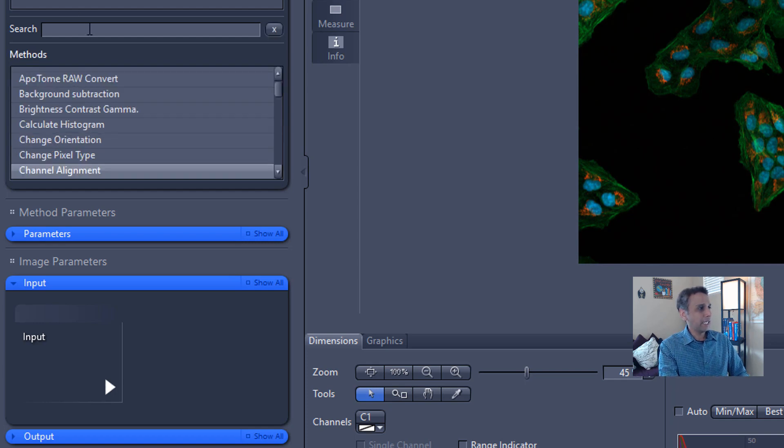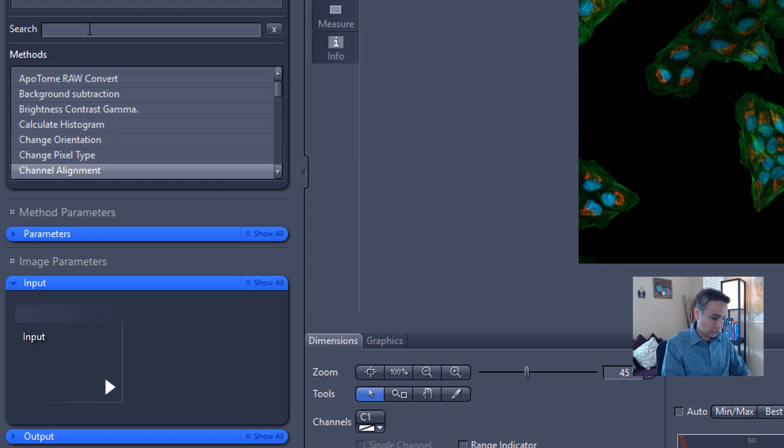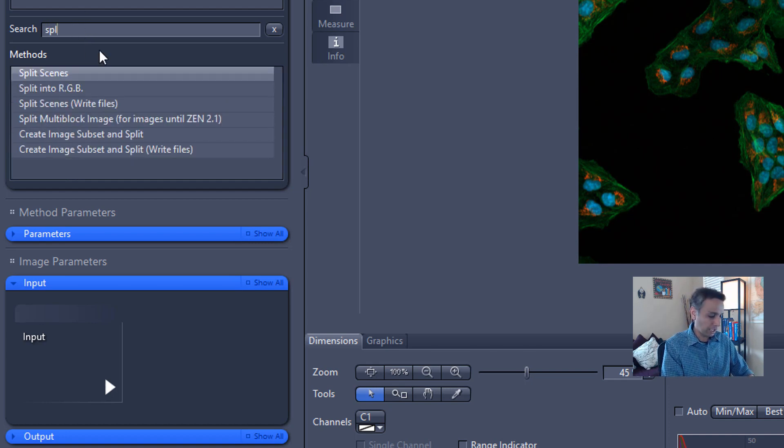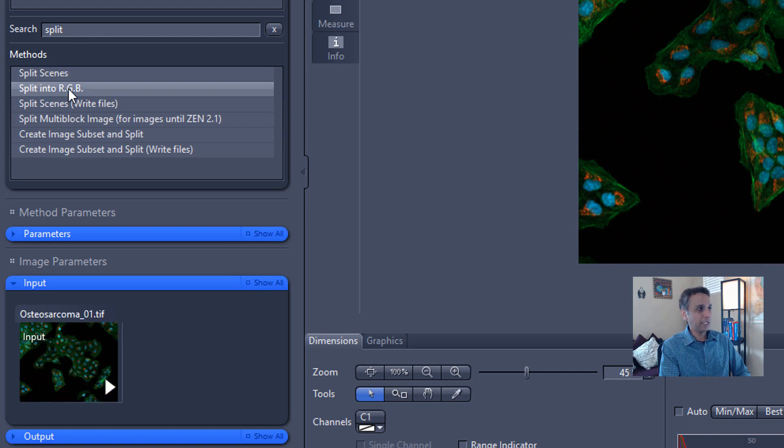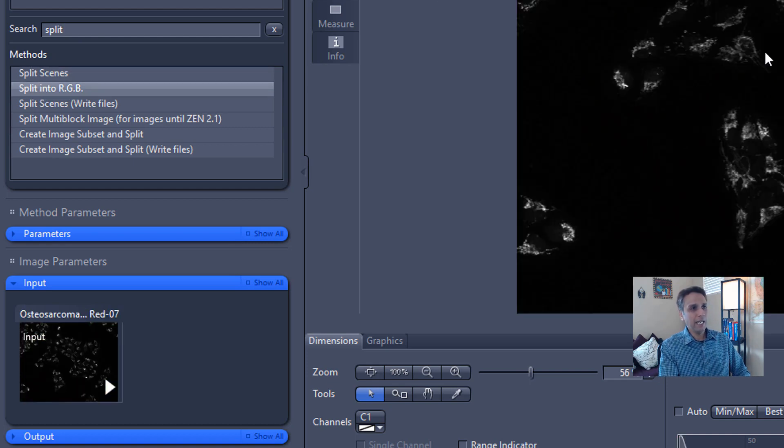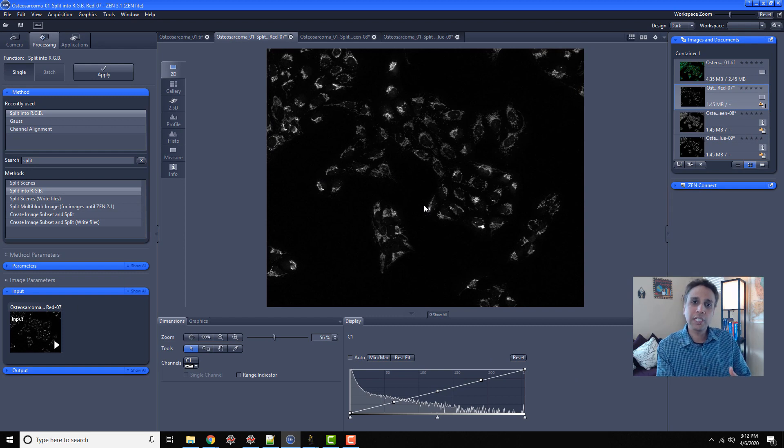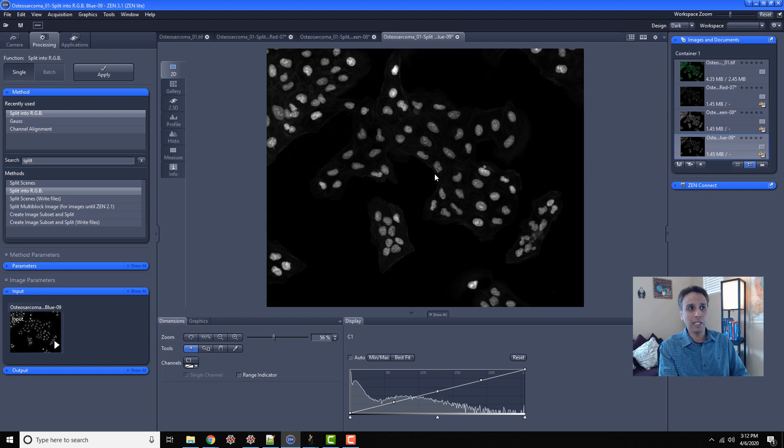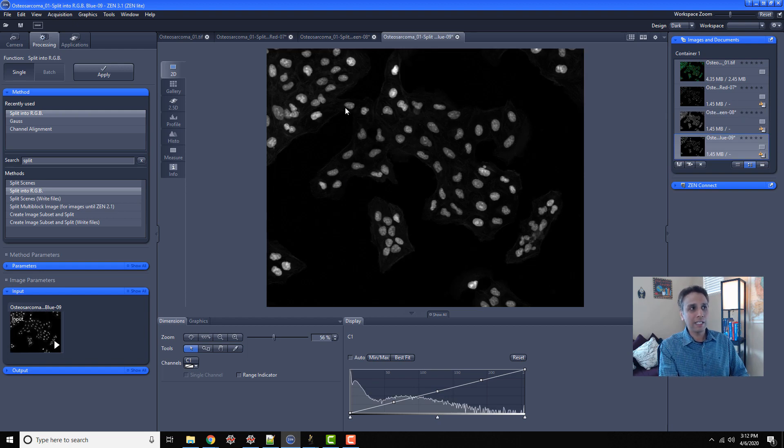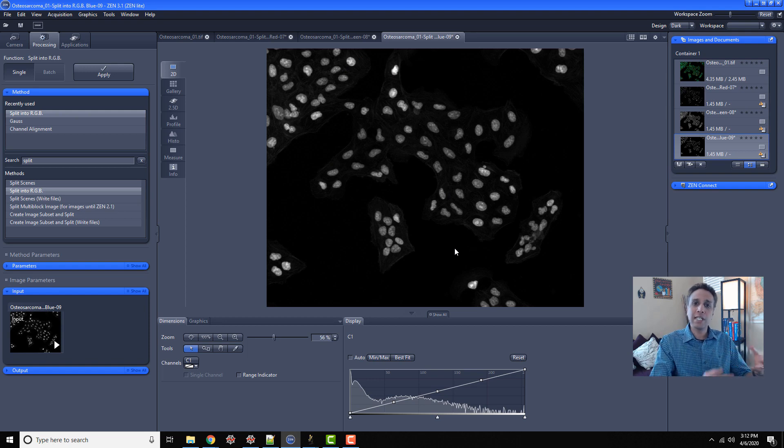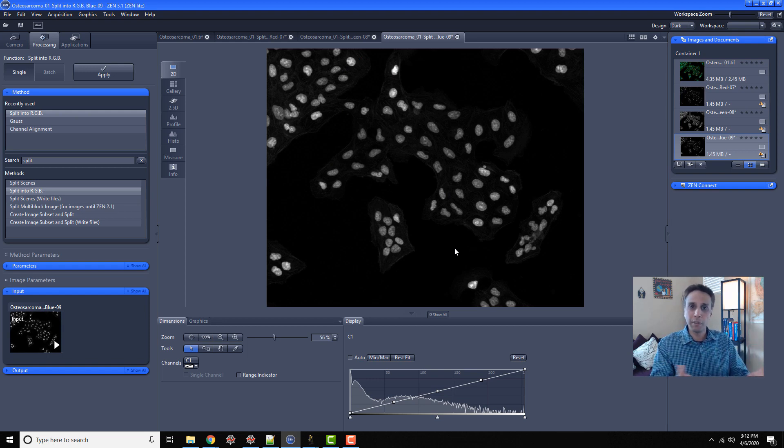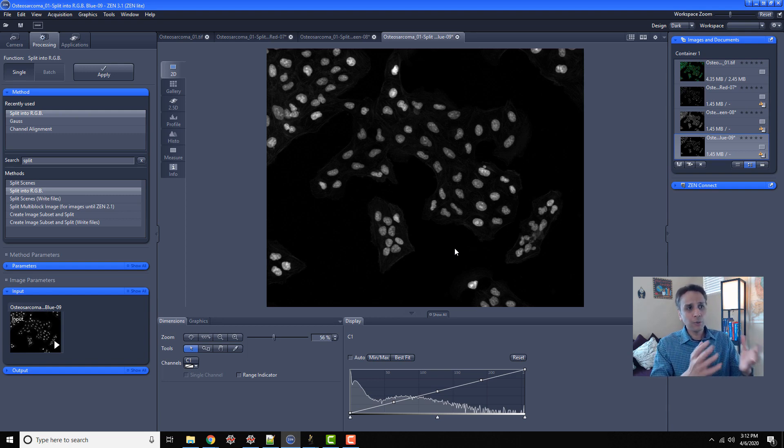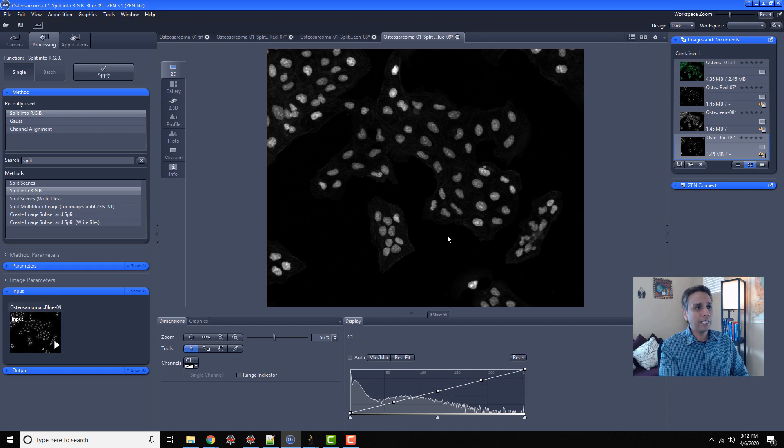I usually get a bit lazy, and I go ahead and search for splitting channels. Split into RGB. I'll just hit apply, and it's going to split my image almost instantaneously into red, green, and blue channels. This is the red channel, this is the green channel, and this is the blue channel. Now you can see the blue. The cells are segmented already. That's because the sample has been prepared such that all nuclei show up in blue color, which is DAPI stained in this case.